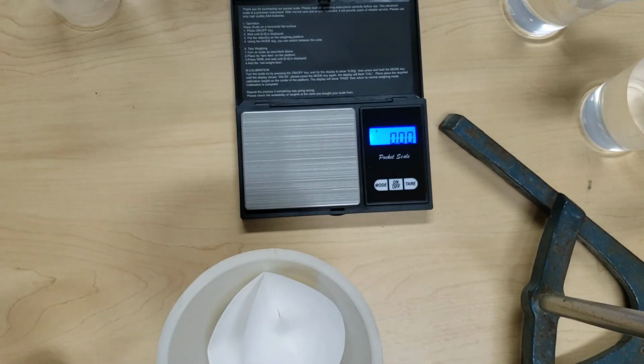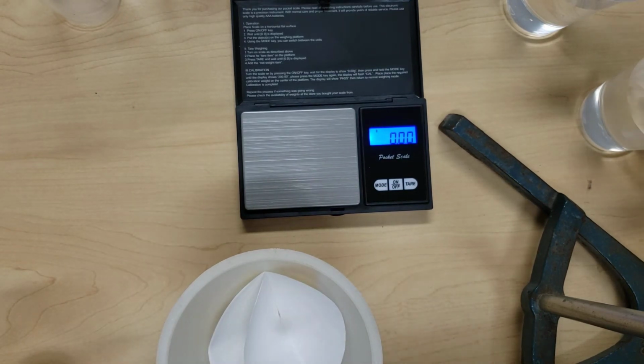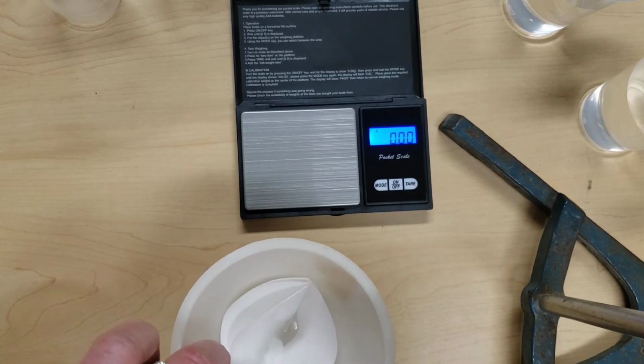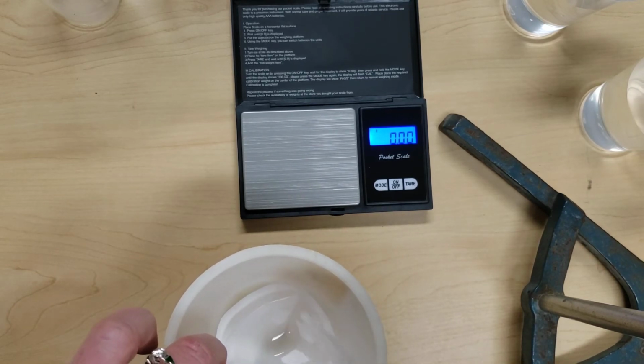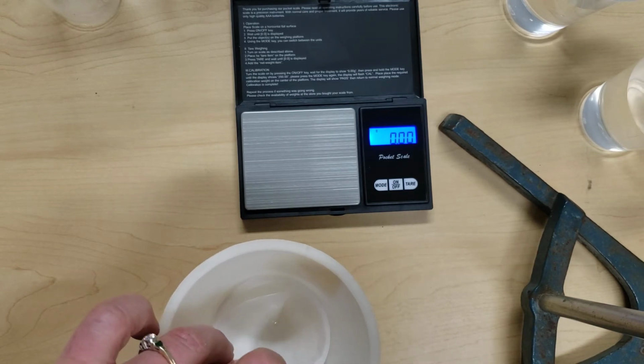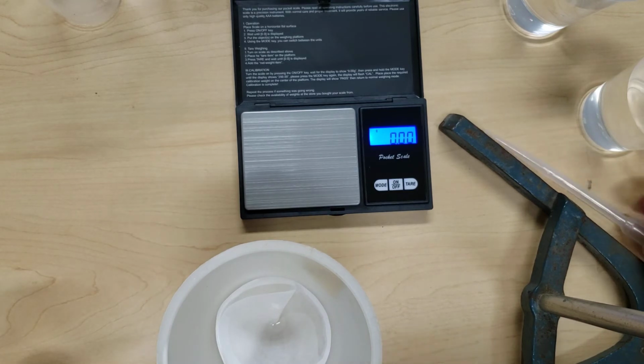Now it may not want to sit well into your funnel, so if you take a little bit of water onto that filter paper and just wet it, then it will sit much nicer down into your funnel.